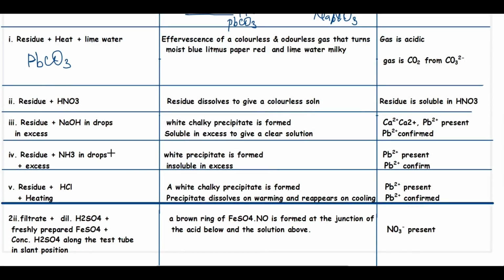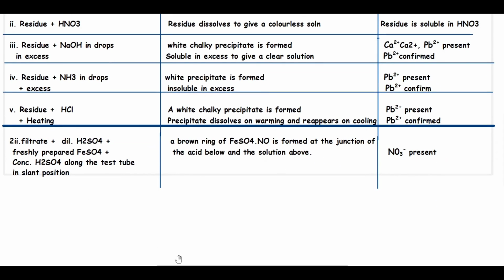And take note, this first part is on the residue. Okay, so these are likely exercises you'll be asked to carry out on the residue. Then the last part of it is on the filtrate, which I doubt if they will ask you to do because of the usage of concentrated sulfuric acid. Students might not be careful enough to handle this, so they might not ask you to do this, but in case they ask you to do this, this is just what you should be expecting.